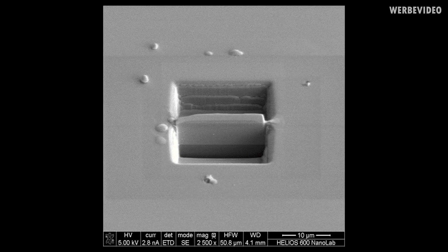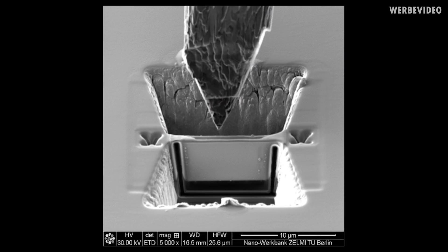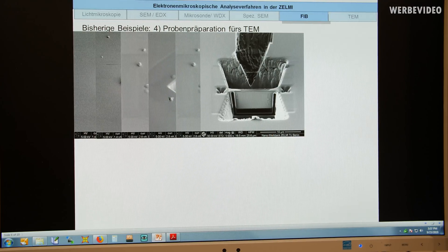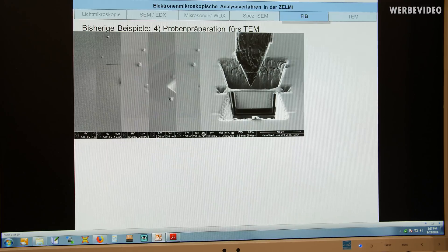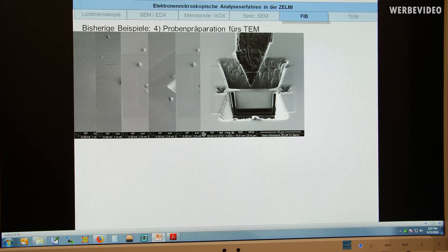And in the next step, we remove the material on both sides of these TEM lamella. This is just done by the ion beam, as we saw before. But now we have two areas, not only one. This is a little bit rotated view. And now we want to release this TEM lamella. And you have to keep in mind here the scale bar. This is now 10 micrometers. So this is one fifth of the thickness of the human hair. So it's very small.